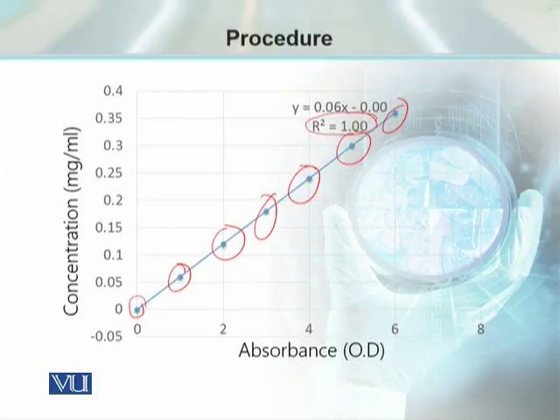This is the regression equation, and the r square value is automatically calculated. If r square value is 1, it means your absorbance, your line is absolutely right and it can be used. The more it is away from 1, the more problems can be predicted in your absorbance values. So you have to go back and you have to do this standard curve preparation once again.